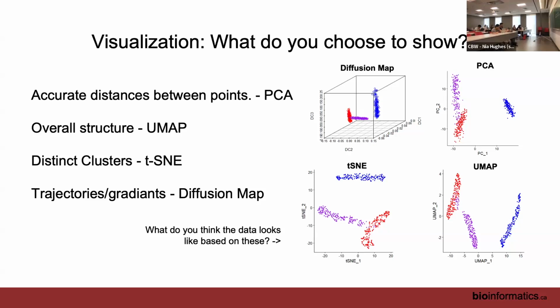Not sure if you've got the Slack in front of you, but we do have one answer from Ottawa: you can't really say, since the dimensionality is too high. Yeah, so it's hard, right? Each of these is trying to show you what your data really looks like, but it's really hard to know what it really looked like.